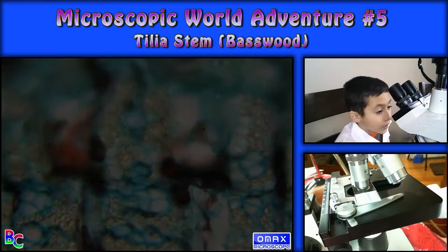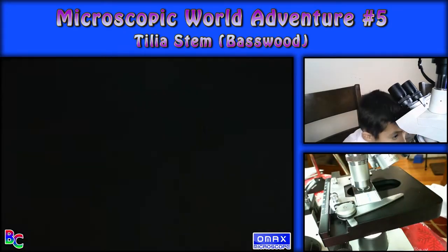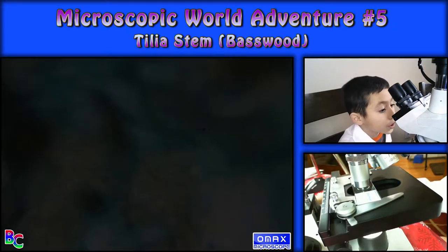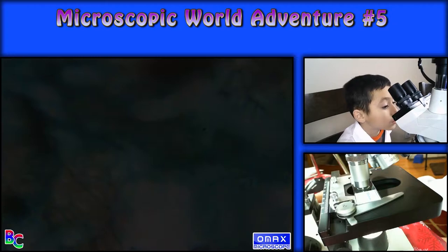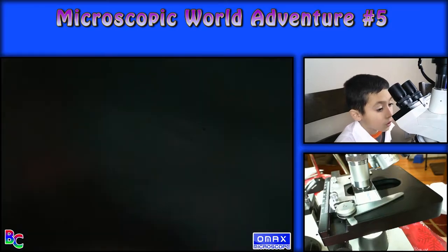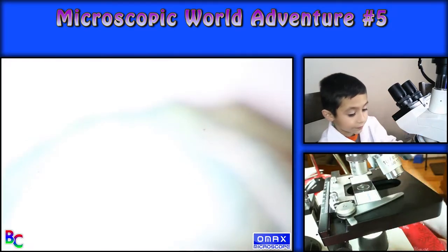Oh, I had no idea that was in there. Let's get some light. So you can sort of see it — there are like holes. I guess that's that.